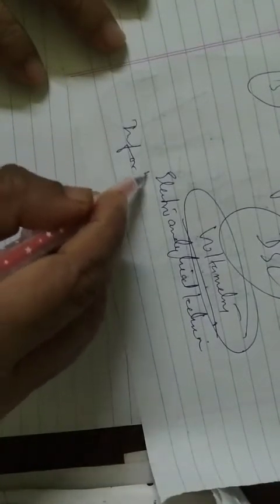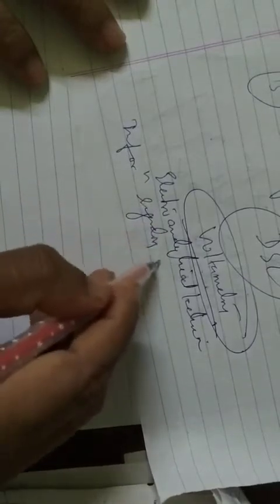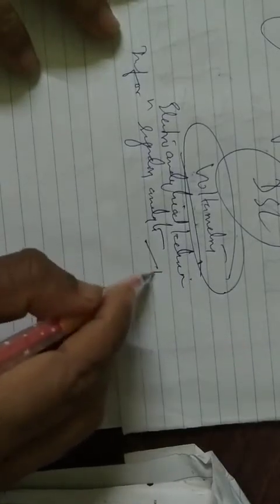We will start with this basic concept here. Voltammetry gives information regarding an analyte. This is determined by measuring the current.